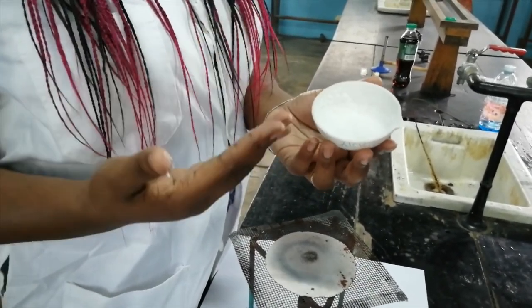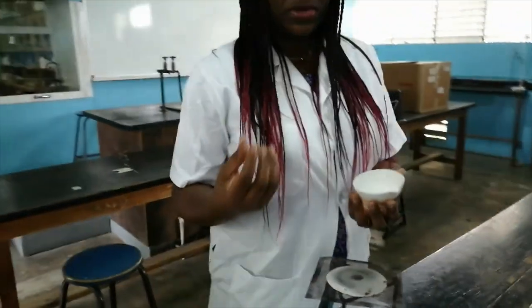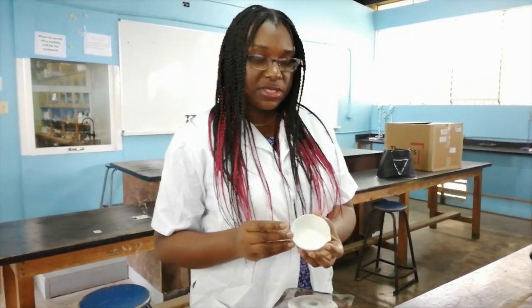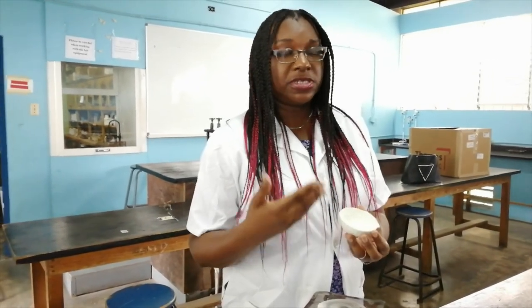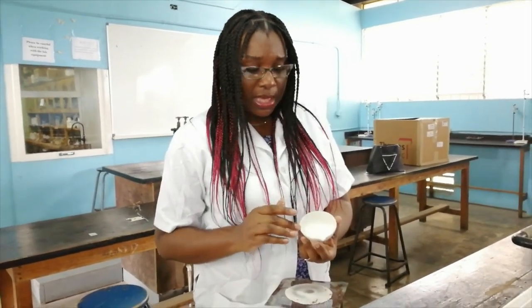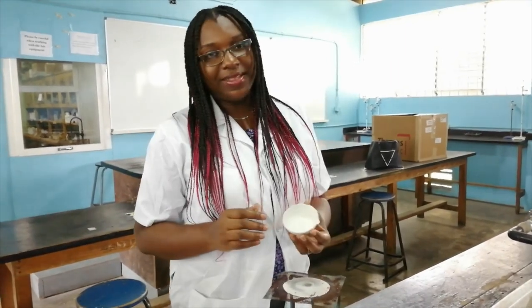We used evaporation to get rid of the solvent. So in order to form those crystals that you see in the bag when you purchase the salt from the supermarket, we'd have to use the process of crystallization, which actually allows the solvent to evaporate at a much slower rate. That is why the consistency of the sodium chloride in the evaporating dish right now is not the same as how it started out. So that's the chemistry behind it.